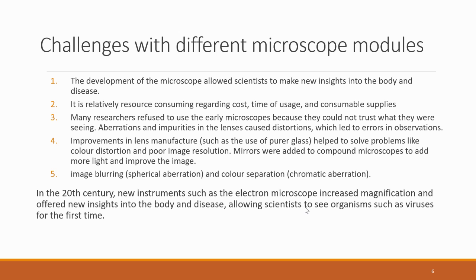I have seen some biologists say we don't trust the microscope because of this, because of that, and that's why there is always a challenge in accepting a microscope. Like I said, some biologists don't believe in the result. They say there is aberration and impurities in the lens, and this can cause a falsified reading on the microscope.